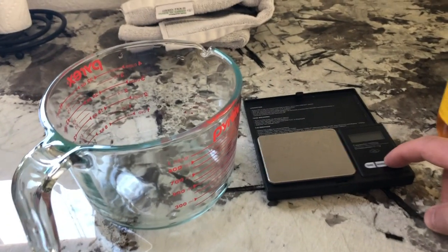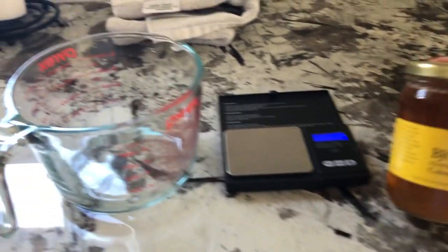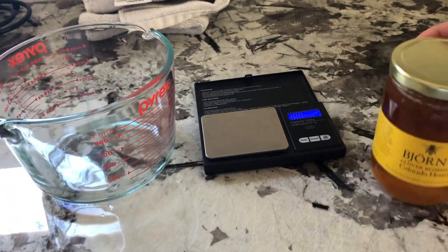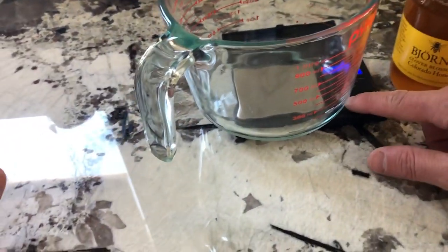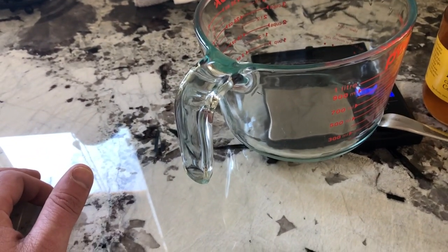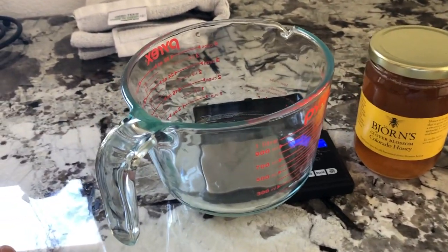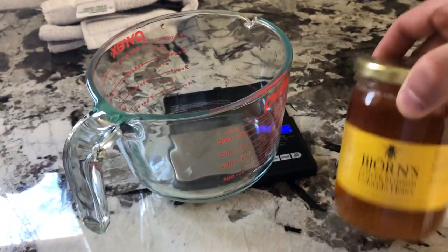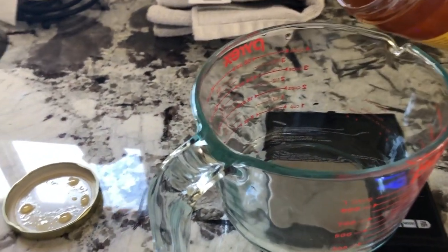All right, guys, so I'm gonna make my 4% liquid culture solution using Bjorn's honey. It's just raw honey from Boulder, Colorado. Like I said before, I prefer using honey. I've used trypticase soy with and without antibiotics before, buffered peptone, and I think that honey is the cheapest thing, and it's what nature provides. So we're going to add 40 grams per liter.